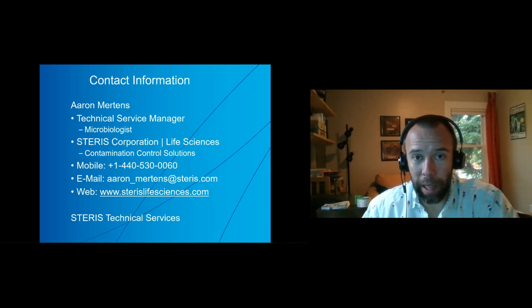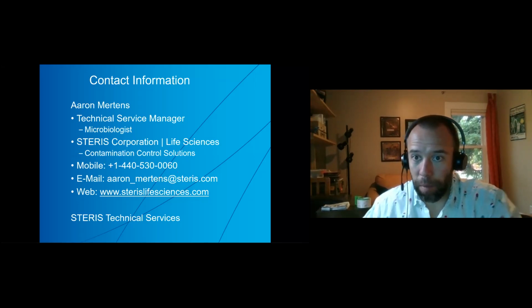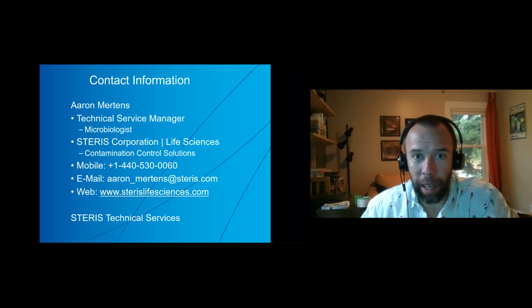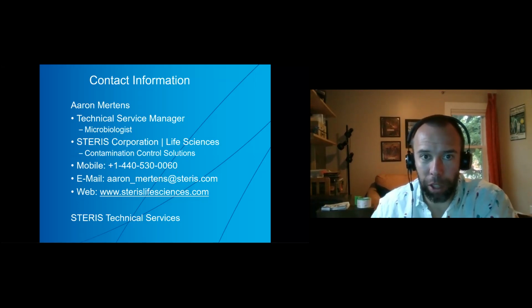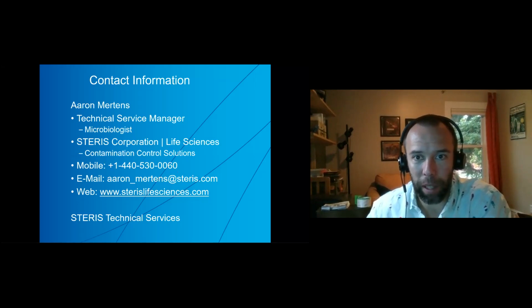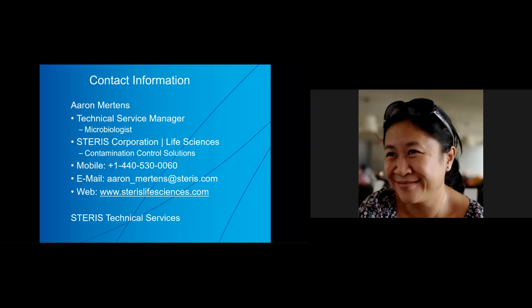So I would say that if you're monitoring and maintaining a pressure on an SIP system, then it can be held for a specified amount of time, whatever time you choose, provided that the pressure is maintained on the equipment. So hopefully I understood that question right, but please send me a mail or chat if I did not understand the question correctly. I hope that was okay.